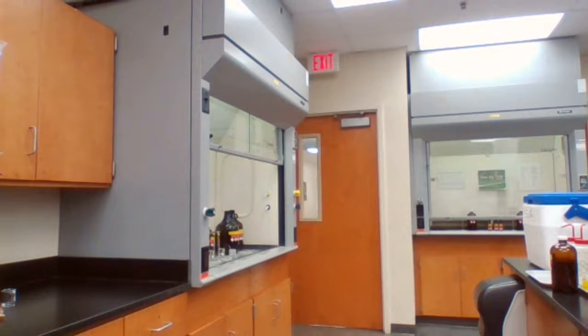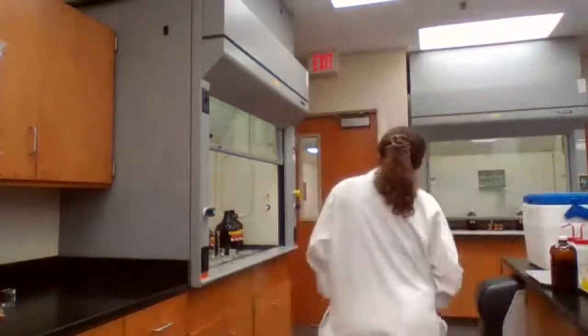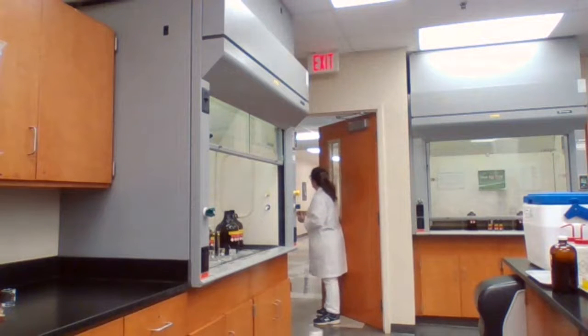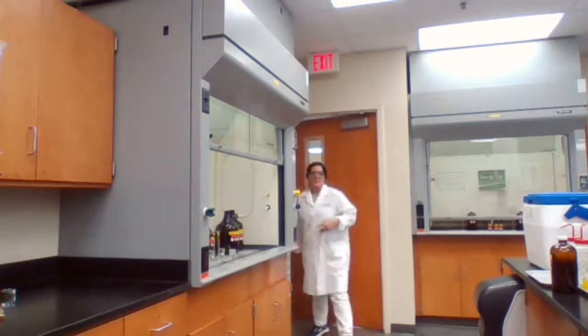Thank you. Brittany, can you please grab solid ammonium chloride?